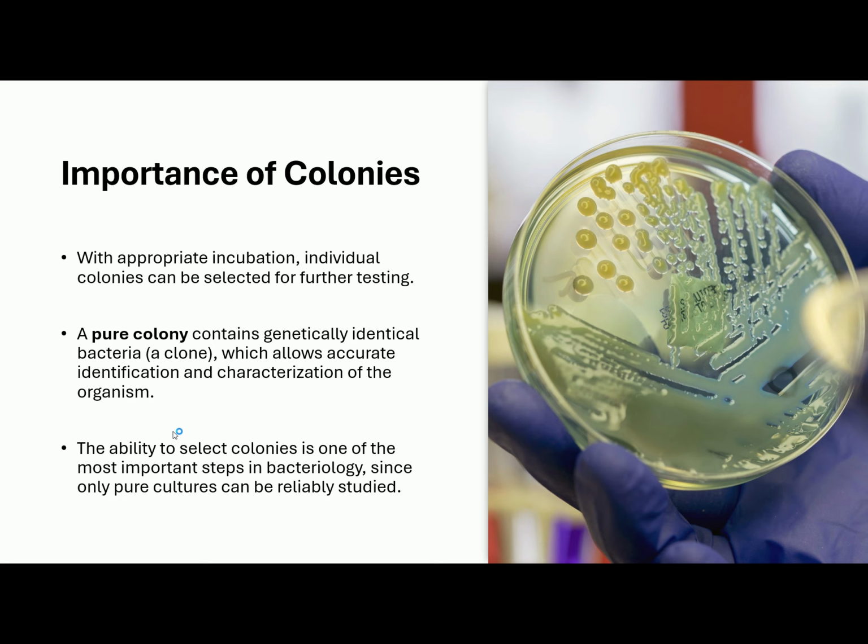Now let's talk about the importance of colonies. When your bacteria grow, they tend to attach to one another, they tend to group up, and they visibly form what we call colonies. So these are the colonies. These are groups of bacteria attached together. With appropriate incubation, individual colonies can be selected for further testing.